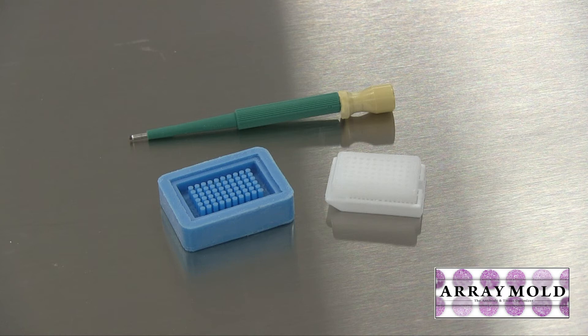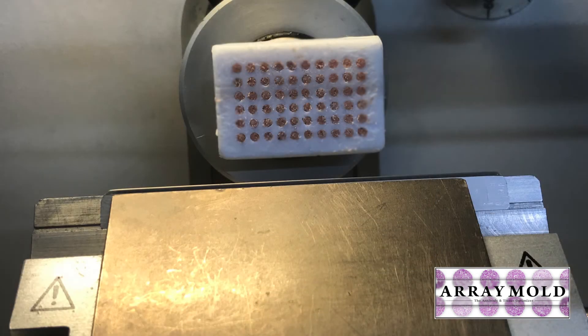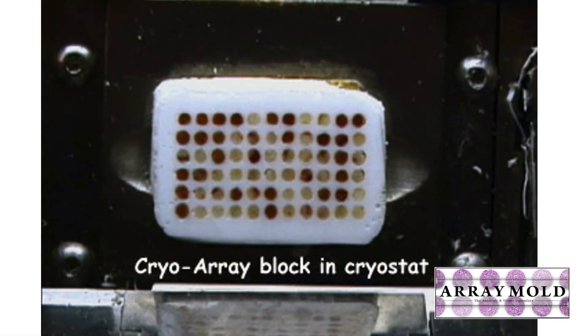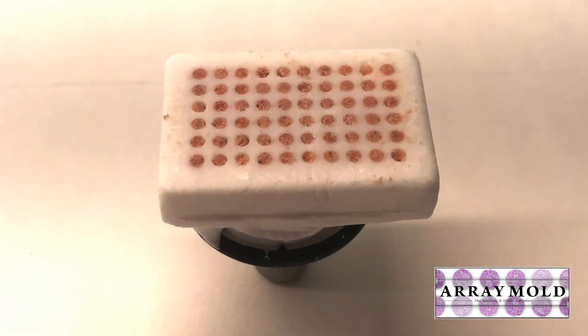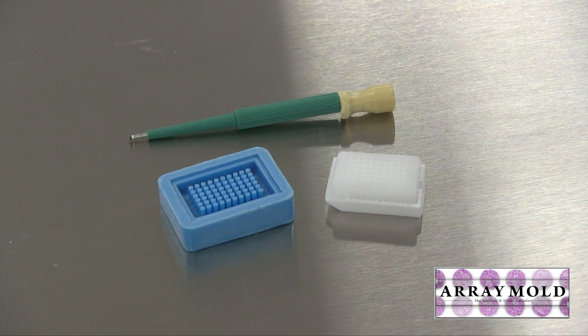One more thing I was able to do with the array mold is make frozen tissue microarrays, or cryoarrays, because you can use it inside a cryostat. To use the instrument on the left in a cryostat you would have to remove the microtome inside and build a platform for it — and remember, those needles are very expensive. When using the array mold to make an OCT block and punch frozen tissue samples, I went through about 4 or 5 needles at only a dollar a piece, instead of a $200-plus needle set. The array mold looks quite small but it is very efficient, fast, and reliable to use.